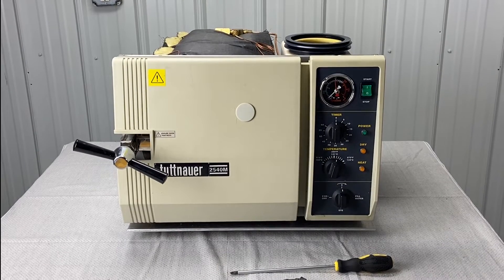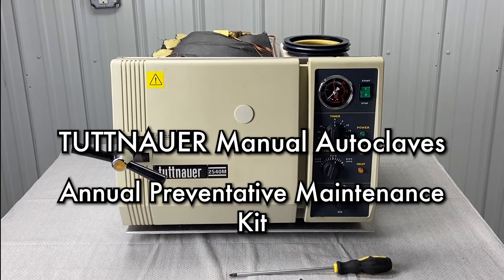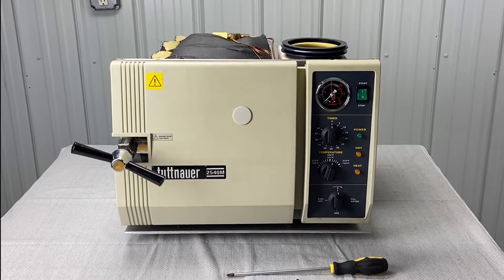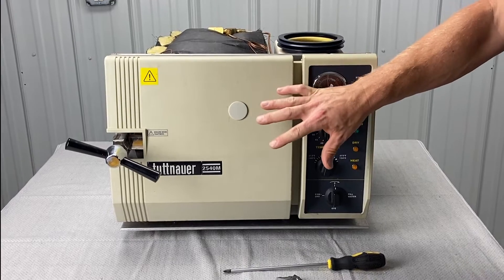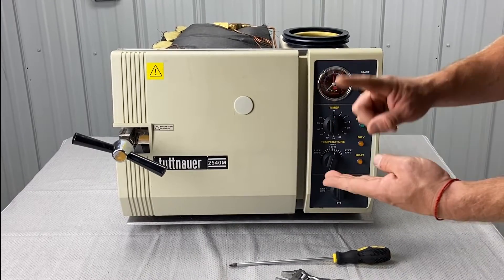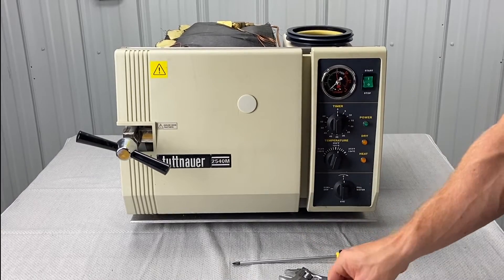Right now we are going to perform an annual preventative maintenance kit replacement. We're currently working on a 2540. The 2340, the 1730, the 2540, and the 3870M all have the same parts in their PM kit.